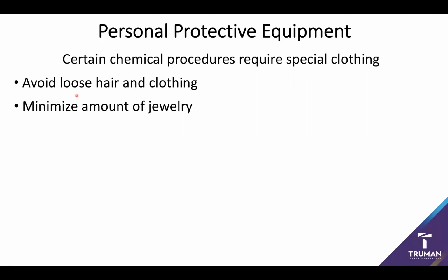And so there have been several incidents where people have been wearing cloth bracelets or cotton bracelets, which, when exposed to the liquid nitrogen, essentially wick up the liquid nitrogen and hold it against the wrist of the person who's using it. And again, this is a good way to end up with very severe frostbite all over your wrist or hand.